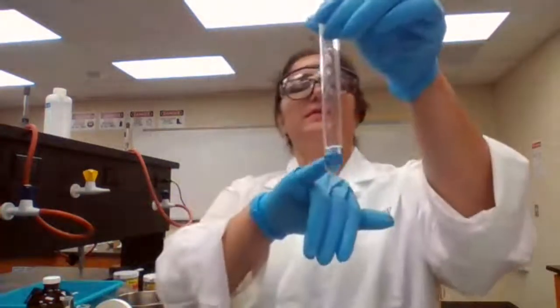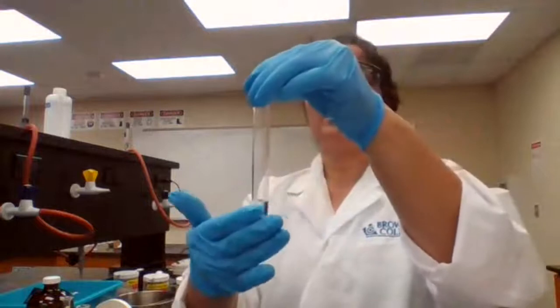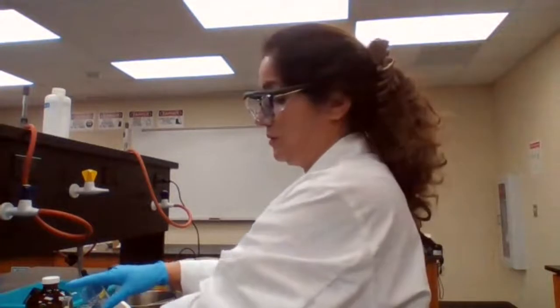For potassium permanganate, it's supposed to be like purple color. Don't see any purple color. Maybe it's just very low concentration. I hope it works. Hope I don't have to repeat the experiment, but 10 milliliters of oxalic acid in other test tubes. So test tube 2 is going to be 10 milliliters of oxalic acid.